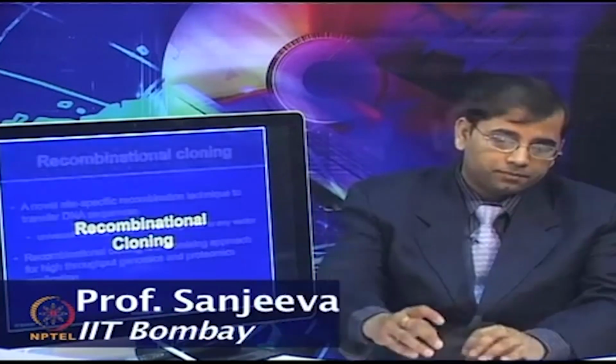The common site-specific recombination technologies include the Gateway cloning system from Invitrogen and Cre-based technology from BD Clontech. In our discussion on recombinational cloning, I will focus more on the Gateway system. It is more so because of my own familiarity using it in my own research, but both the systems can be used for recombinational cloning.